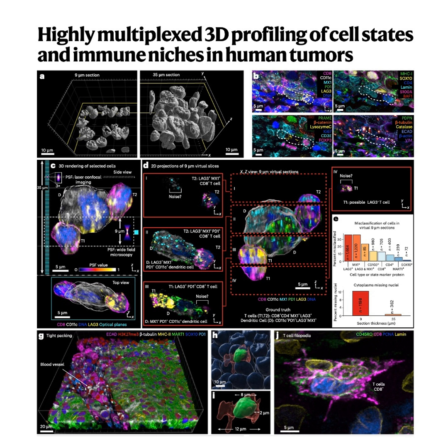And then there's another problem you mentioned earlier, the overlap issue. That must be rampant when you physically squash a dense 3D tumor environment down into a flat 2D image. Oh, absolutely. It's a huge confounder. When you compress that three-dimensional volume into 2 dimensions, you completely lose the z-axis information, the depth. You can't tell what's in front or behind anymore.